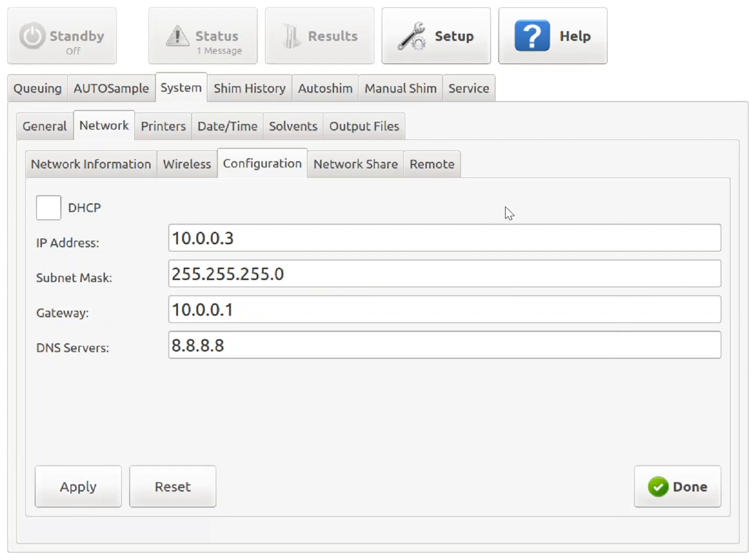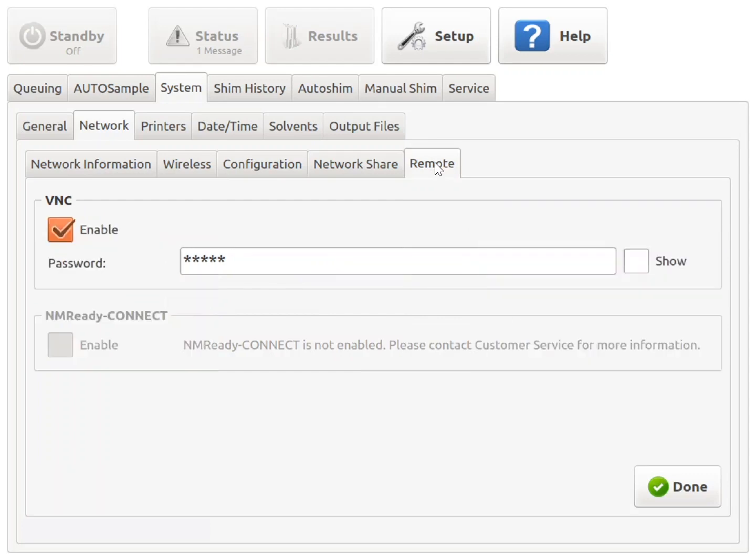From this screen, you would navigate to Remote and make sure that the VNC connection is enabled, just like we did in the first scenario with LAN access. At this point, the steps to gain access to the spectrometer using the UltraVNC software are identical to the ones used in the previous scenario.